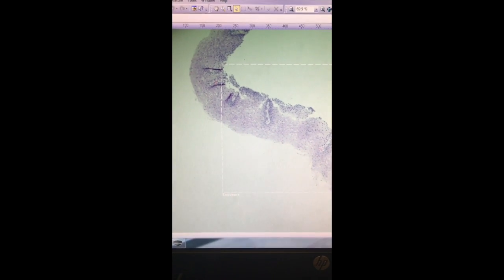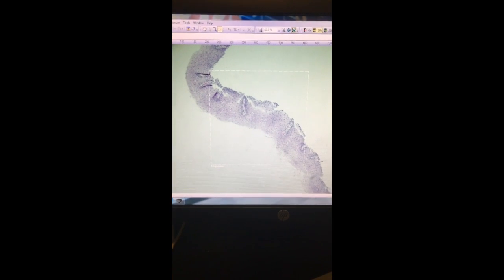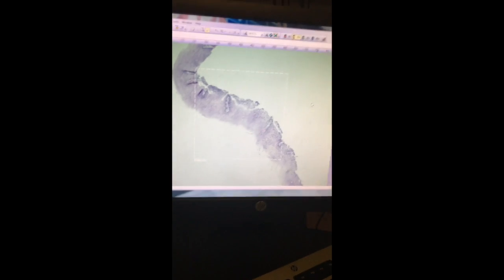So this is what we consider normal control. This is someone that doesn't have an EGID disorder. And they're usually here for like motility or clean out, and they graciously give to research because they're going through a scope already, even though they don't have the disease. We value them very highly because in order to prove science and prove something in your population, you have to be able to prove it against a healthy person that doesn't have the disorder. And it's very important for us to have a normal control to base something against. So what I wanted to show you guys with this is like a baseline for what this looks like.